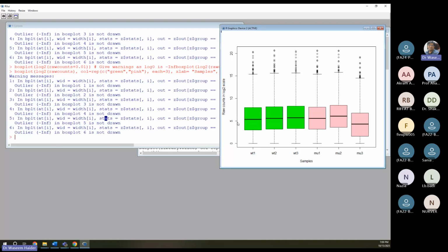5 is not 5, but it is 2 power 5. So that's 32 plus a little bit. I think it was 38 or something. That was 2 power 6 probably, or 5.5. And then you can convert it back and so on. We have their medians here, right?